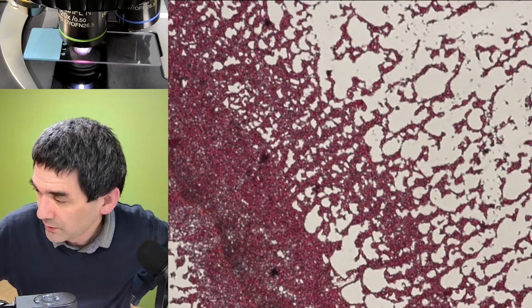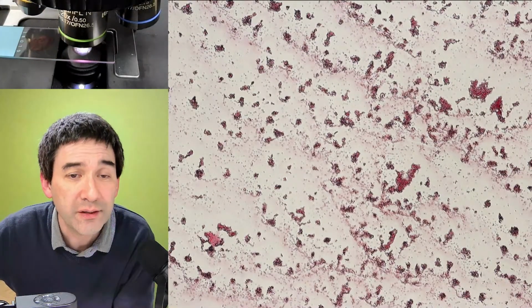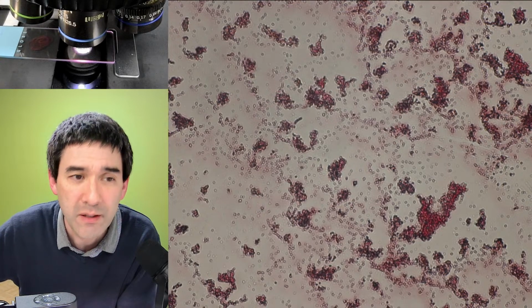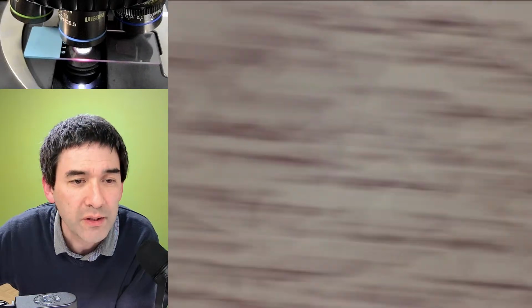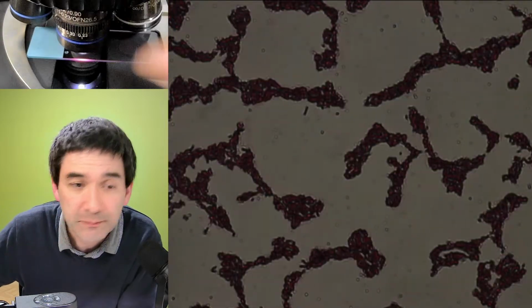I'm going to show you; that's why I made the other slide as well. The other one over here is also red. Okay, let's go up 40 times. Both of them seem to be Gram negative. Maybe if we're lucky, we find some contaminants, since it's not a pure culture. No, that's definitely red. Okay, so 60 times.